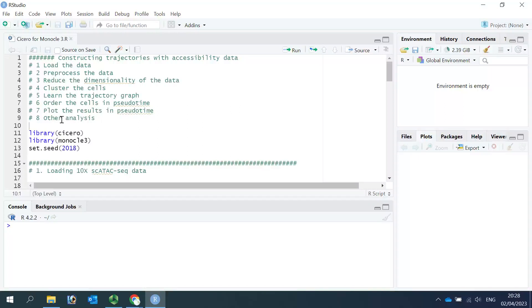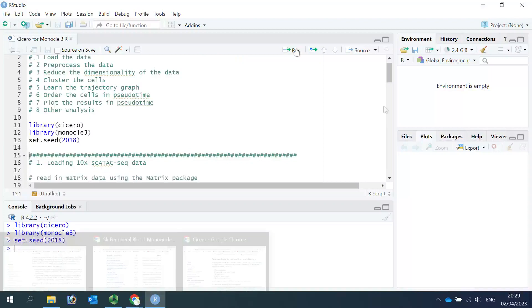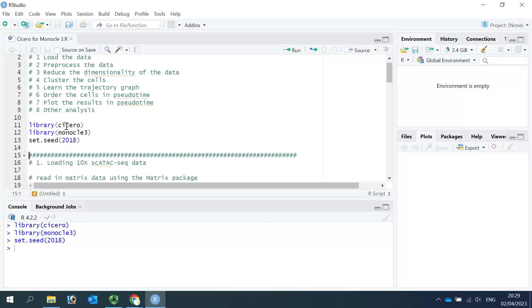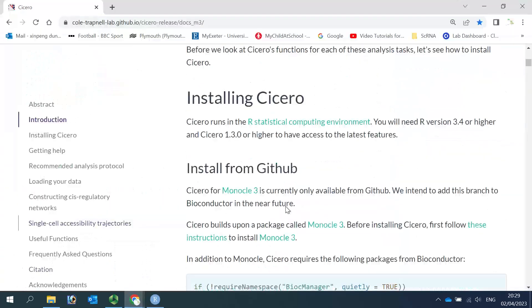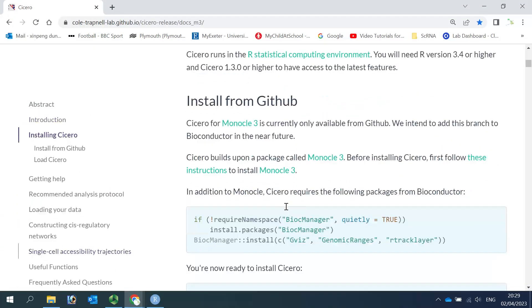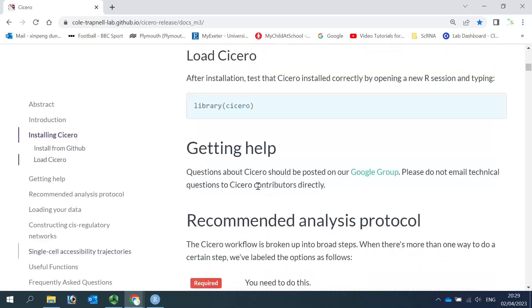Today I'm not going to go into details for the last step. We can load the packages Cicero and Monocle3, and also set the random seed. You can follow the online tutorial to install Cicero — you can see the installation instructions there.